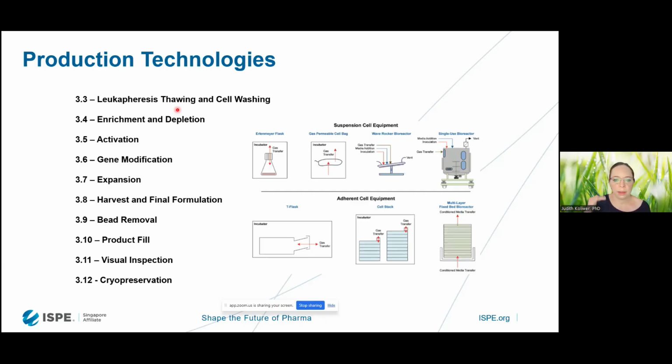protocol itself, like the amount of degrees per minute, that's more or less a given in this kind of equipment, but then there are additional things that we really can receive. For example, the amount of reporting of timestamps, for example, between the start of the thawing cycle and the end of the thawing cycle, using different parameters that the system recognizes itself. So that's really where we have seen considerations that make a difference if we select the vendor from these tabletop equipment.